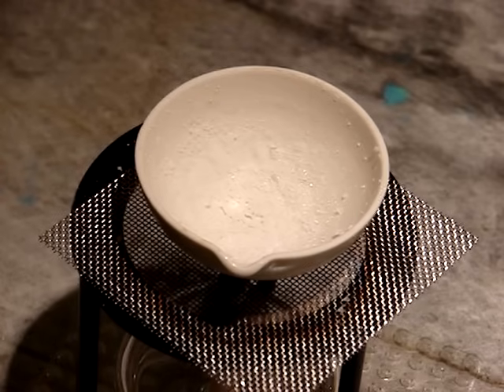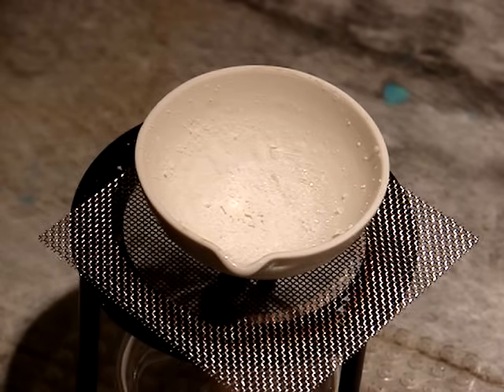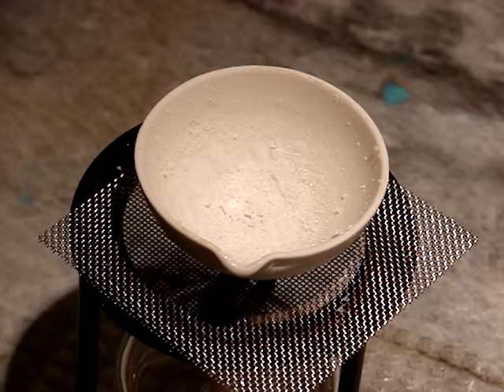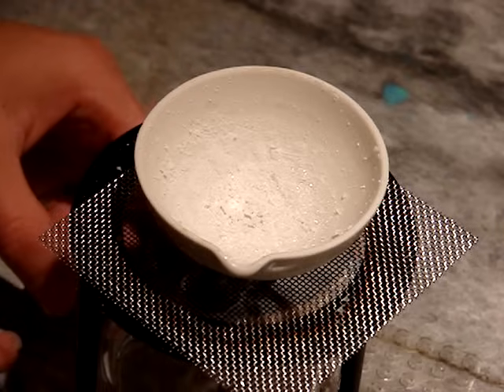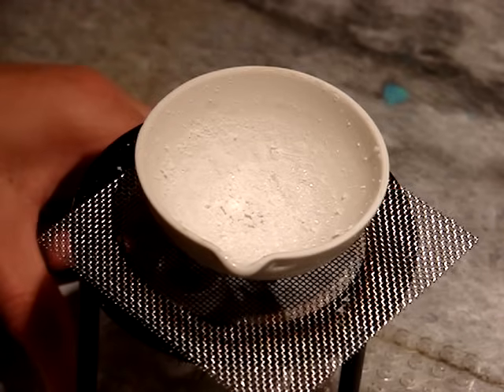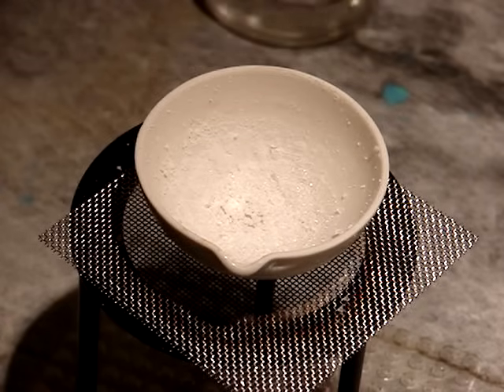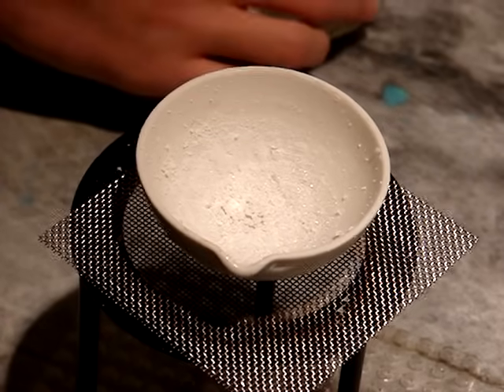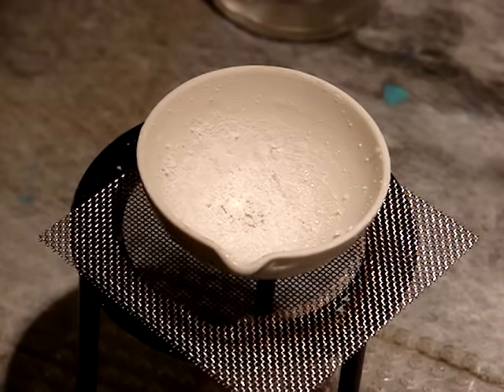Okay, so now you can hear the sort of steam escaping. And after that's done, I'm going to take the alcohol burner out and cap it, which is soon. I think this is fine. The alcohol burner itself isn't hot, so I can touch it with my bare hands. And I'll cap the flame. But for the rest, I have to wear kitchen mitts.